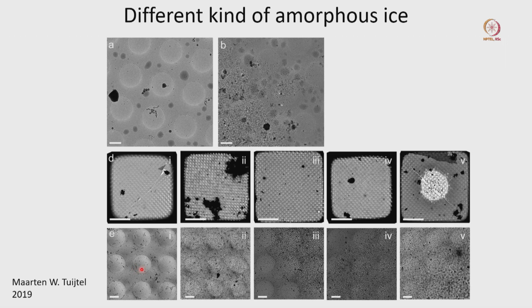These are basically ice contamination. And here there are a couple more squares where, maybe due to a temperature increase or other parameter changes or bad handling, you can see different kinds of ice patterns. We will discuss these things more in the next class. At that time I will show you the good images and bad images also.